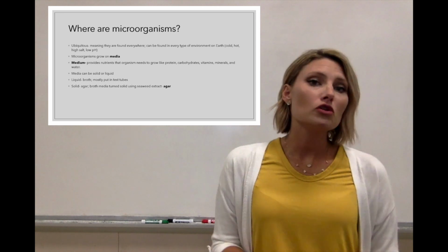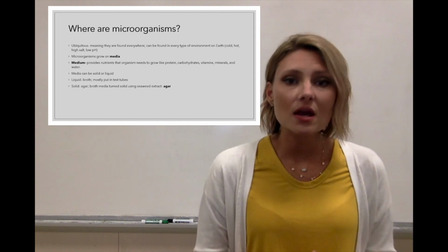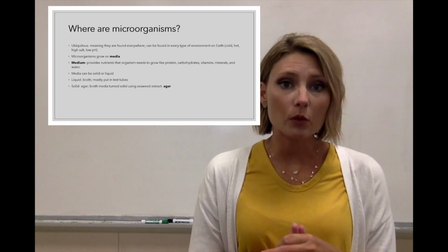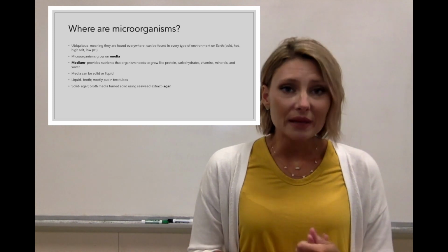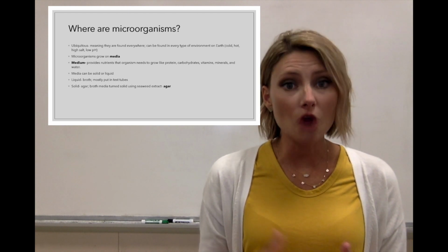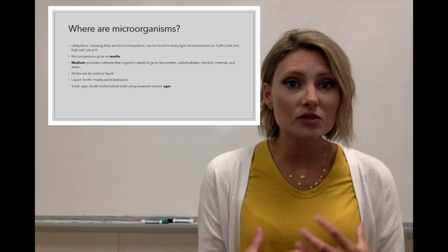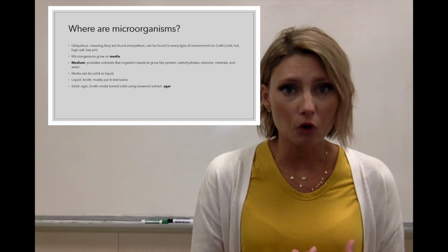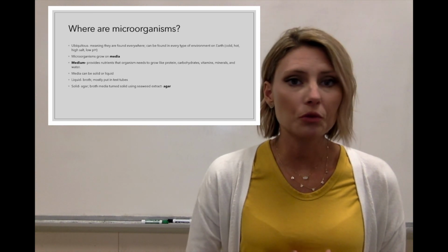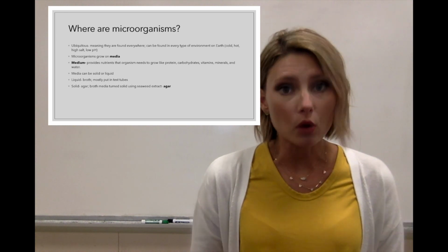Okay? And then we usually will incubate it in an incubator to keep it at a certain temperature that it likes to grow at. So there's two different types of media. There's solid media and there's liquid media. Liquid media is also known as broth, and it is just that. It is a broth. It is a liquid. You put your bacteria into the broth, and they use that broth to grow, and they grow within the broth. These are pretty much always found in test tubes, but you can also put broth in larger bottles depending on what you're using it for.